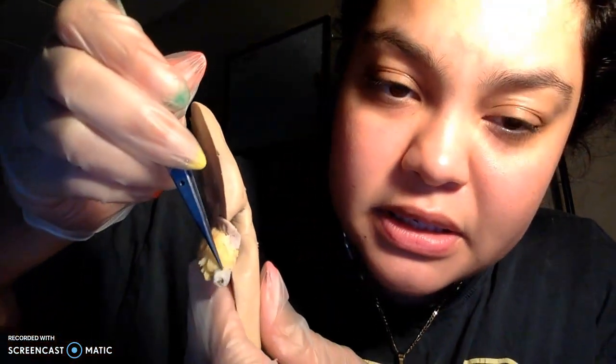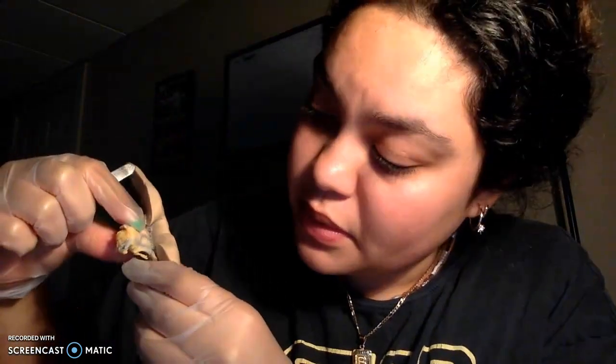Yeah, the renal pelvis. So this is the ureter right here. You can kind of see it sticking out right there with a little hole. So that is the inferior portion of the ureter. So the superior portion would be up here. Up there. So the inferior, superior portion of the ureter.